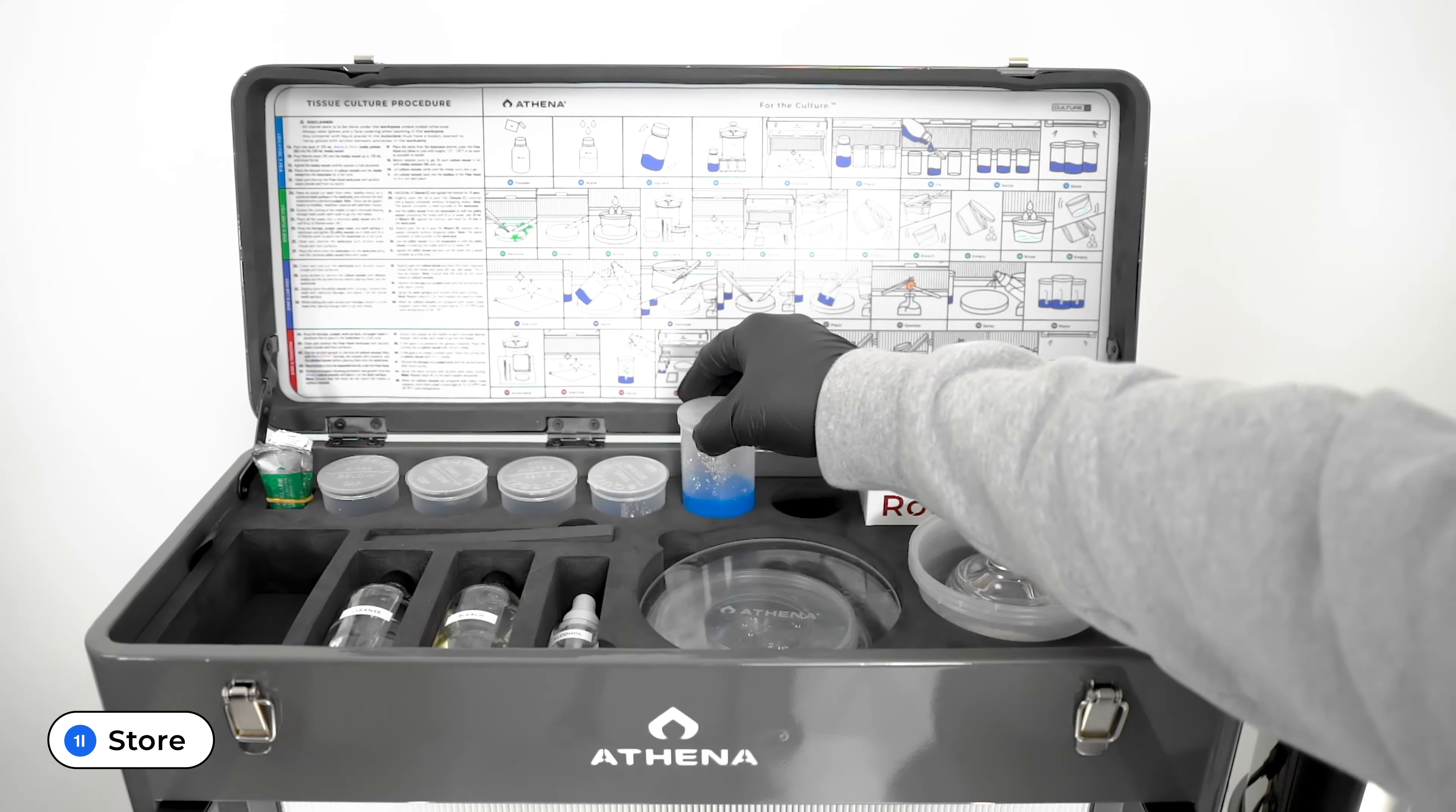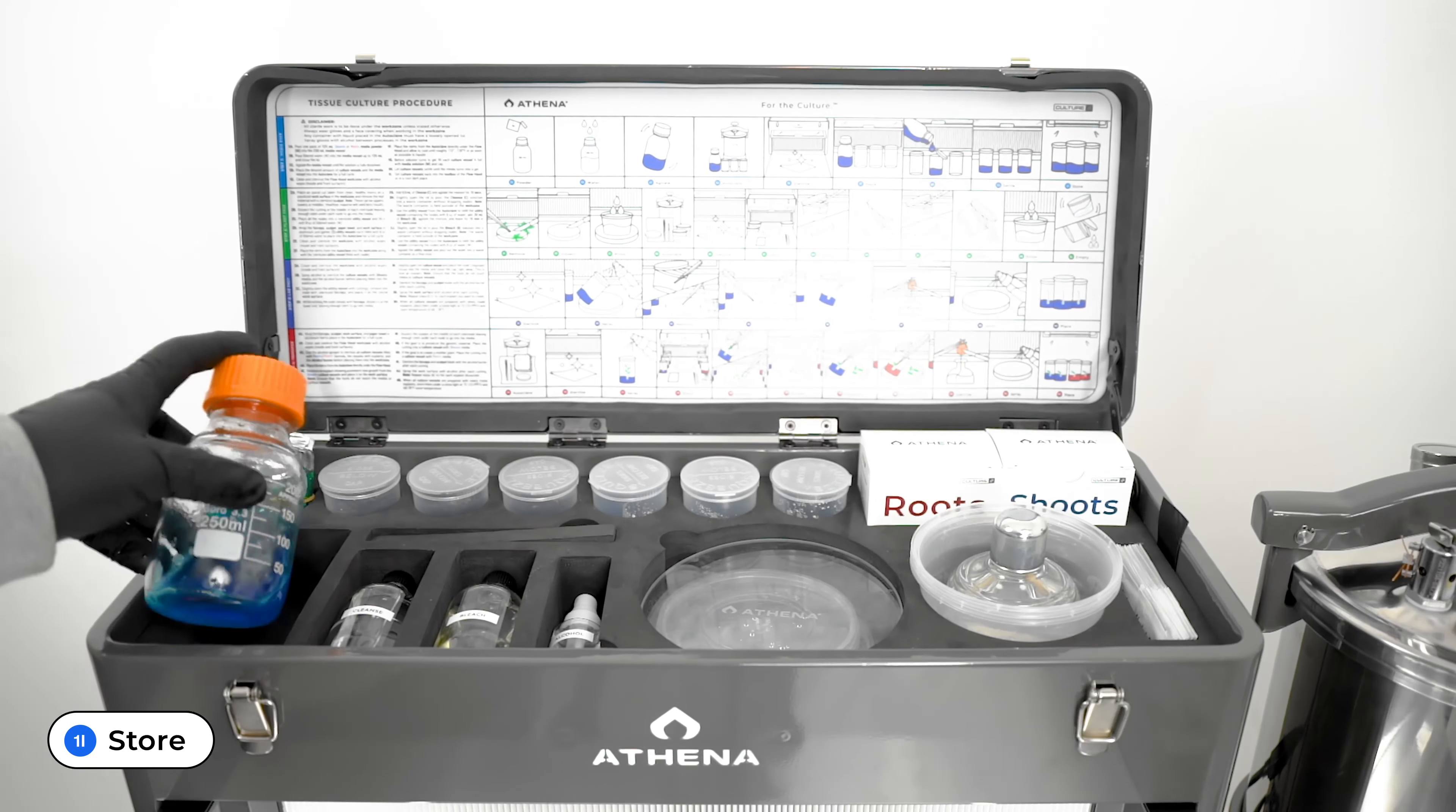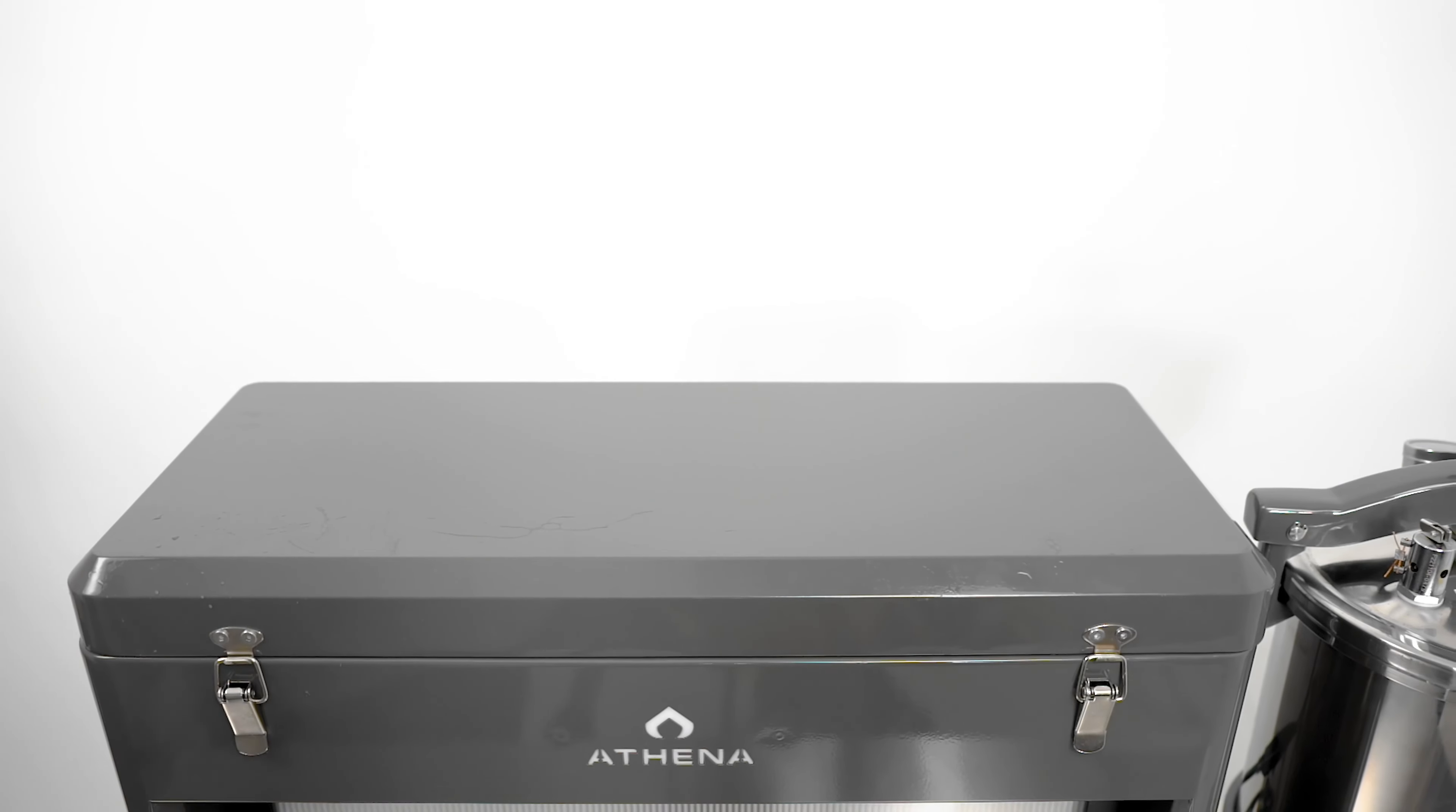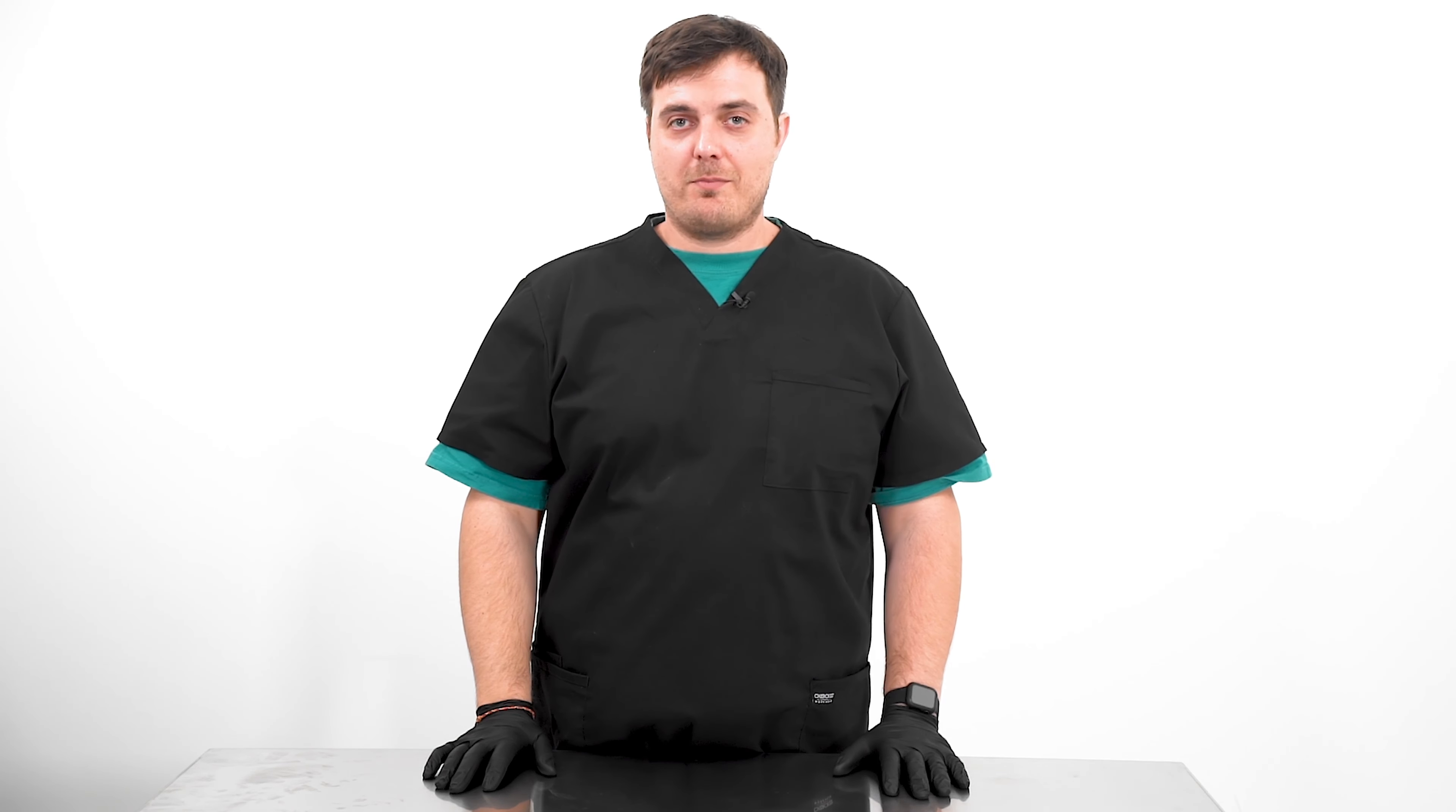Set the culture vessels back into the toolbox, flow hood, or in a cool dark place. You can make multiple vessels and save them for later use. Now that you made your gel, watch our video on plant prep or transfer.